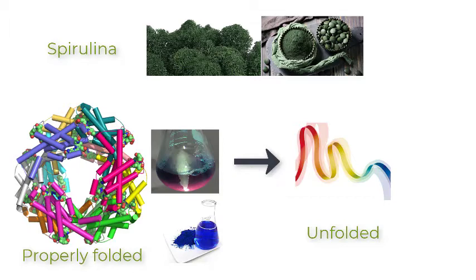So you have two obvious properties to observe in order to decide if the protein structure has been altered. We can use color and fluorescence. Inactivated protein, especially when completely unfolded and denatured, will be yellow and not show any visible fluorescence. Phycocyanin is easily isolated at neutral pH. This will be isolated from spirulina in a phosphate buffered solution.